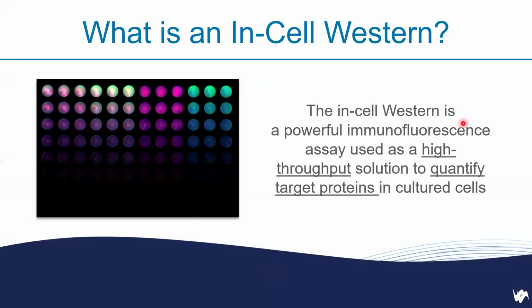So in-cell Western is a powerful immunofluorescence assay used as a high throughput solution to quantify target proteins in cultured cells.